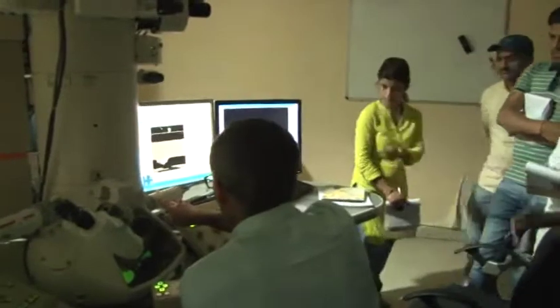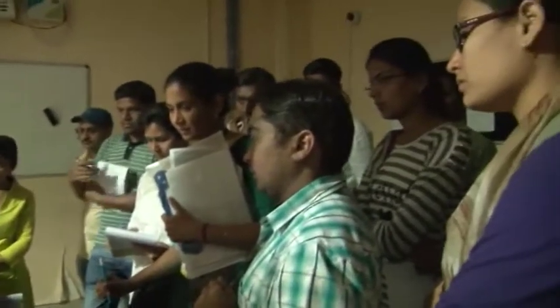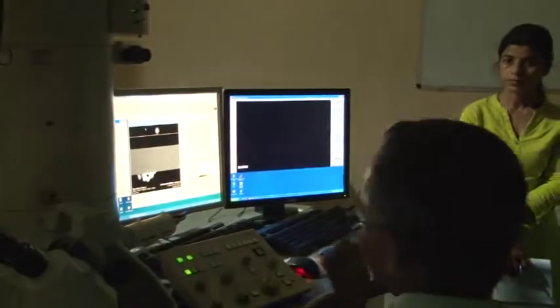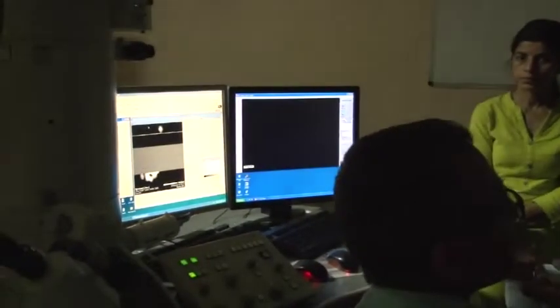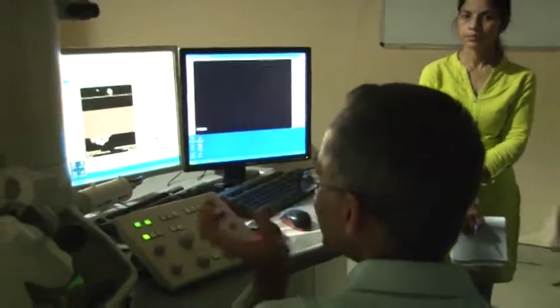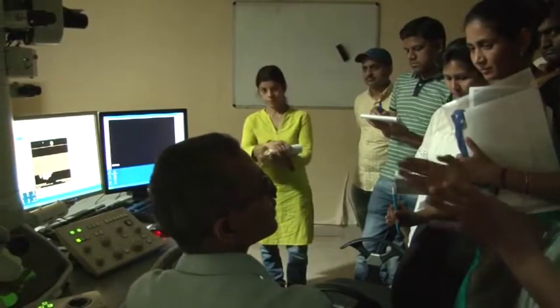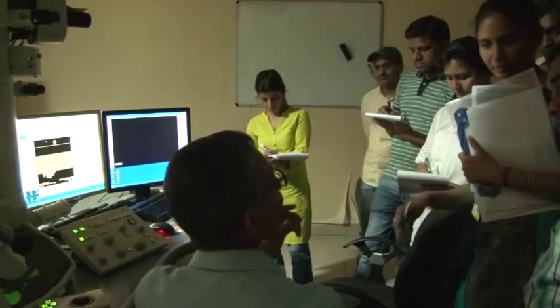This one is the bright field scanning transmission electron microscopy detector. And this is the dark field. But this dark field, depending upon which sector is used or what camera length is used, can also be called a HAADF detector. No, high angle annular dark field.